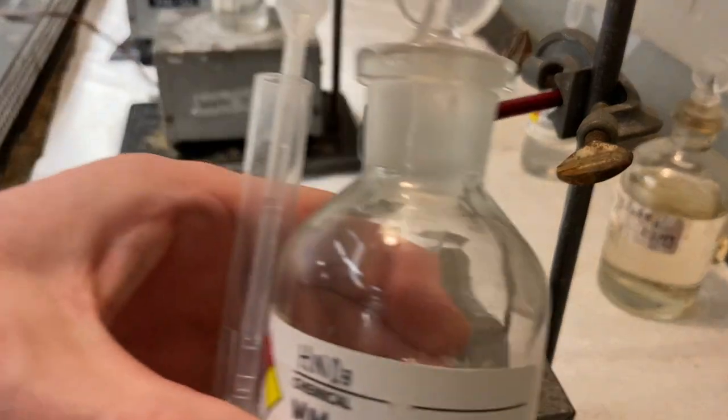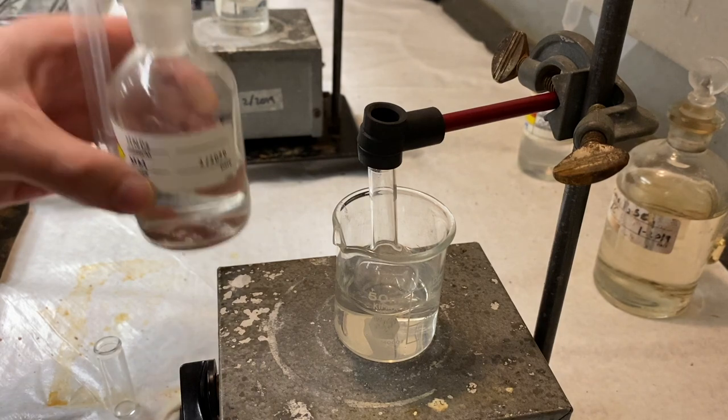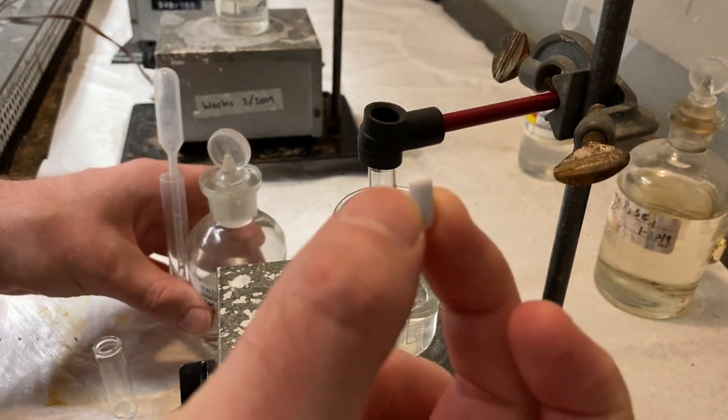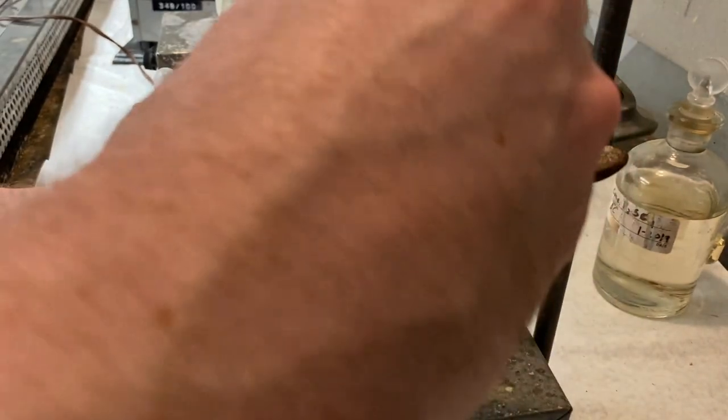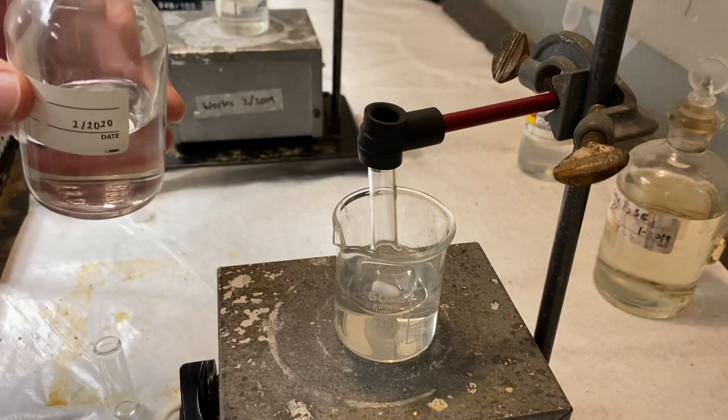We have some concentrated nitric acid. We're going to add one milliliter of this to a flask. But before we get too far, I'm going to go ahead and put in the magnetic stir bar into the flask, so that way it won't splash around when I add it later.